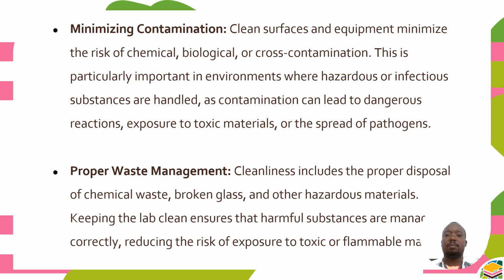Then the same cleanliness ensures proper waste management. Cleanliness includes the proper disposal of chemical waste, broken glass, and other hazardous materials.